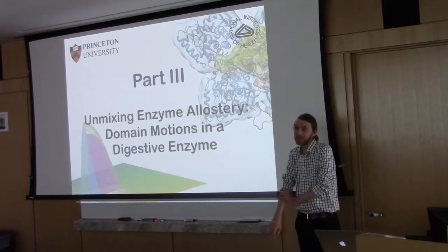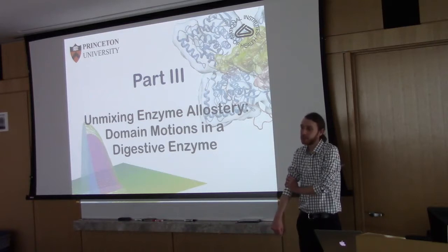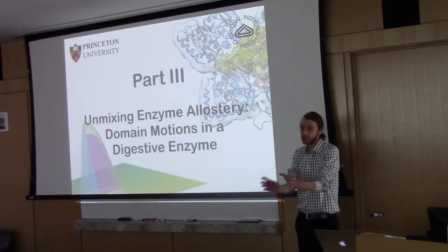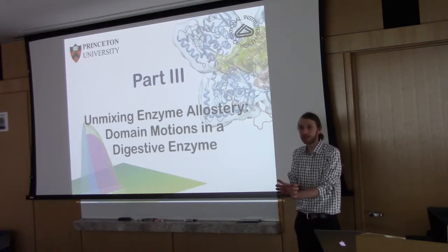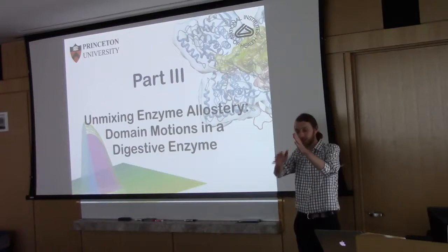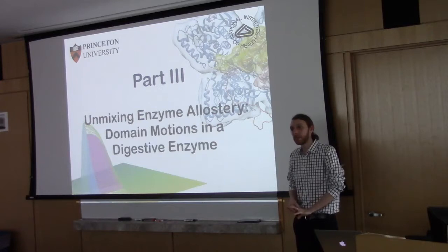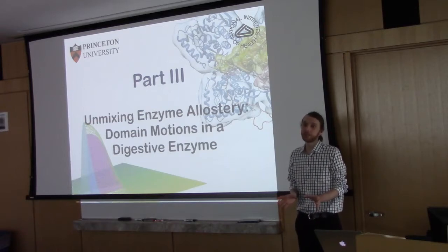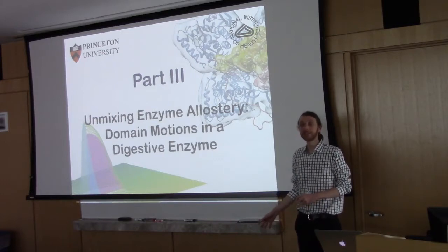Yeah, so the more separation you can get, the better, obviously. The analysis methods can deal with incompletely separated peaks, although the more overlapping they are, the more ambiguous. And it's not just the width of the peak, it's also the amount of tailing that happens at the end of the peak. So I would say it's worth spending time getting better separation on the chromatography system as opposed to trying to analyze ambiguous data.